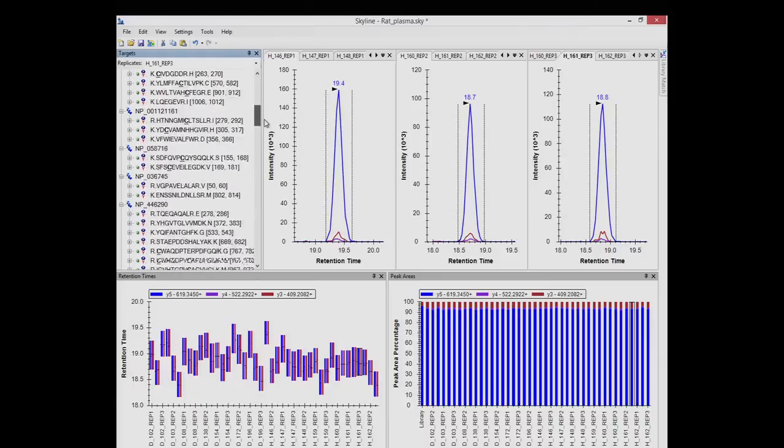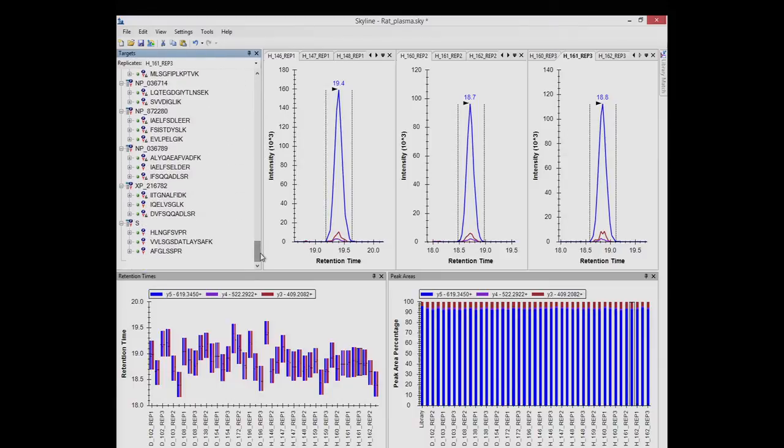Okay, so now let's go all the way down to the bottom of the document. And at the bottom of the document, we'll see this S protein. These are the 3 peptides that were injected into this sample. I think they're worm proteins or worm peptides.